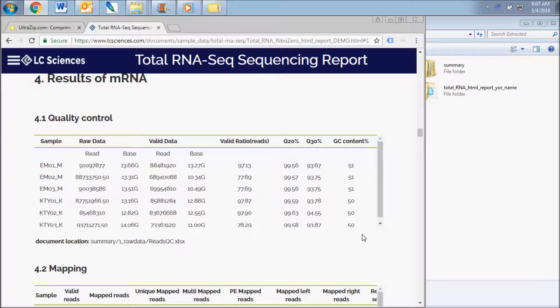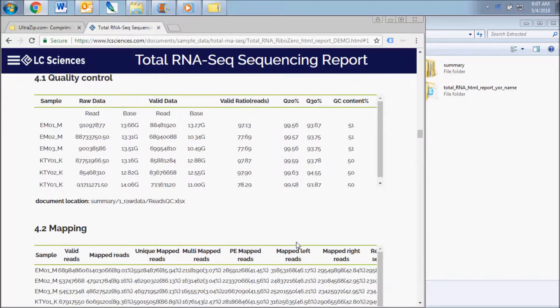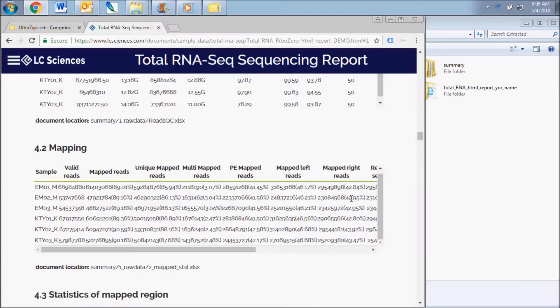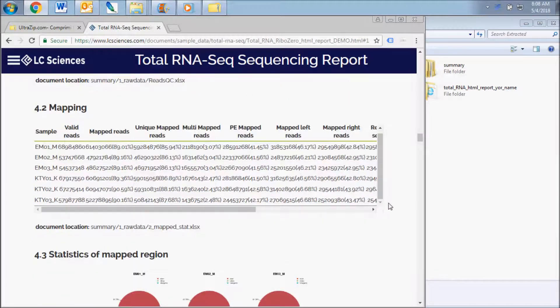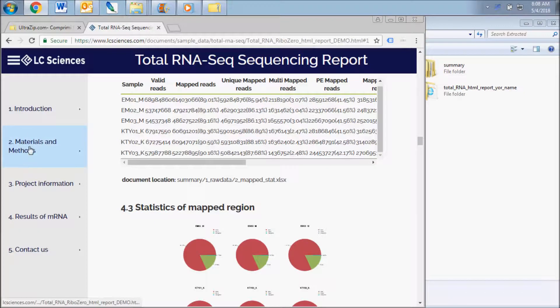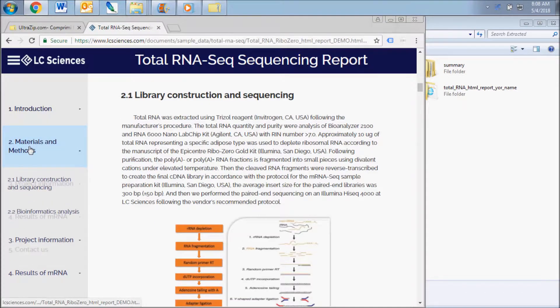At the end of each subsection of this report, you can find the location of the document or documents in the final report folder that contains the entire dataset. When viewing the HTML file, you can navigate between the sections of the report using the menu on the left side.